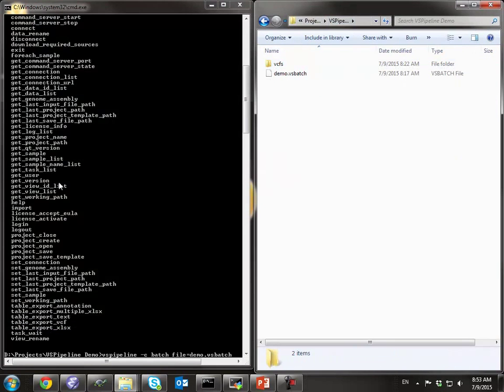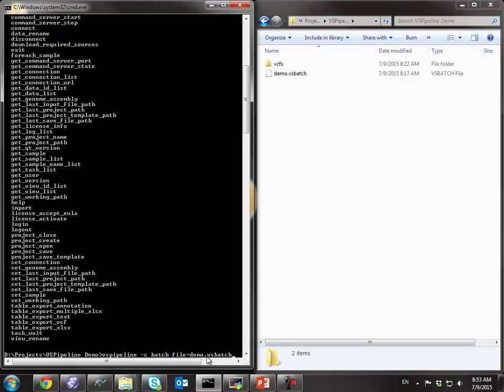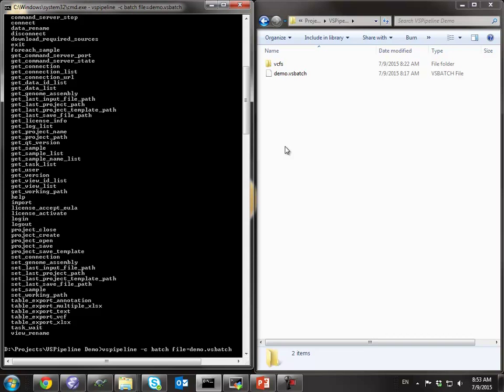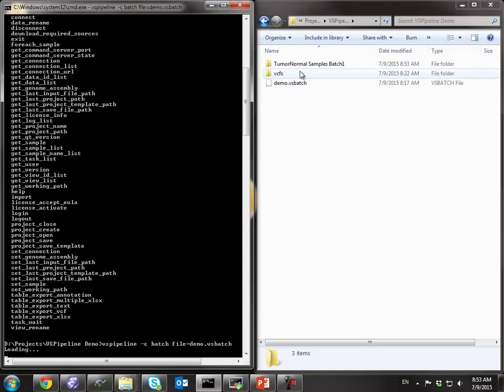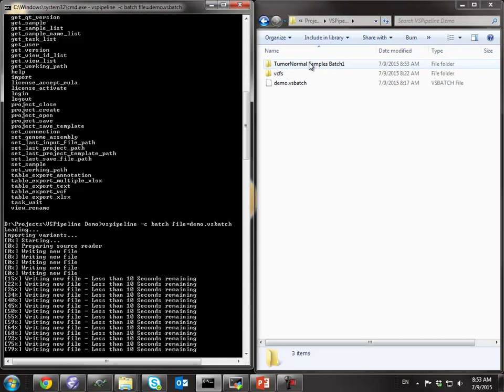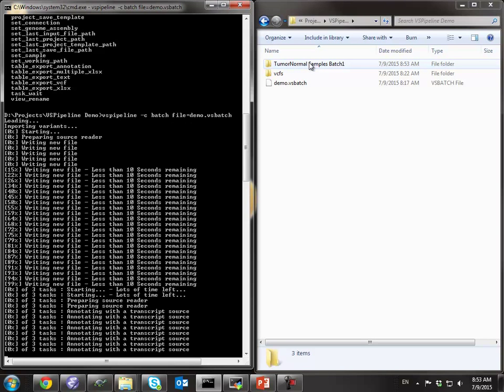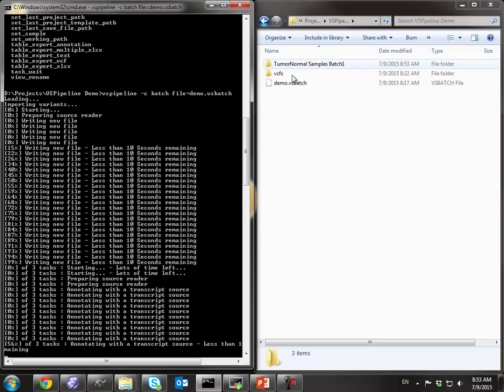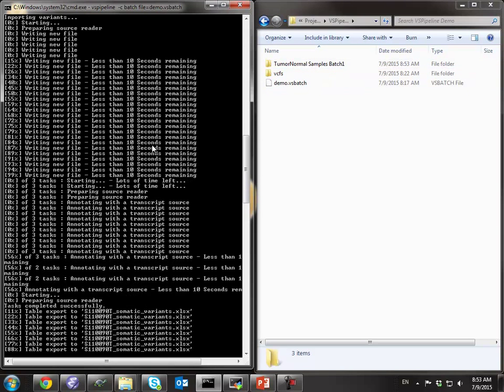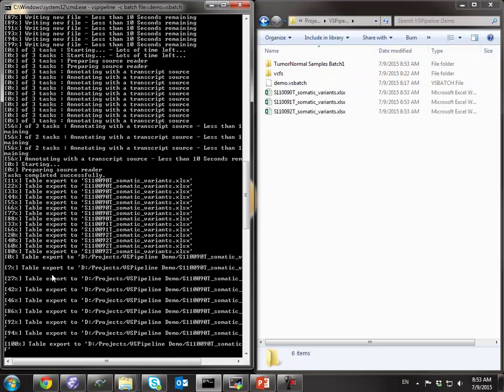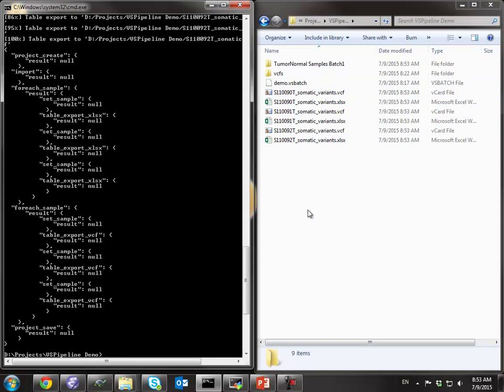All right, let's go ahead and run VS Pipeline in batch mode with this file, and watch the files get created as it goes. The first thing it's doing is creating a project — and there's that project folder. The second thing it's doing is filling it in with all those VCFs, and that's done, and now it's exporting these files.